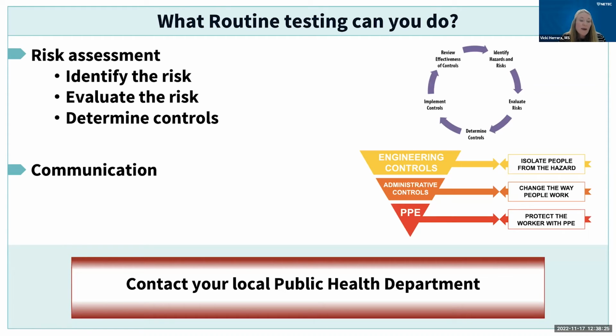All right, so after you've done your risk assessment, you went through identifying and mitigating those risks, what tests are you actually able to do safely? Each facility may have a different answer on this based on their size, the resourcing, staffing, etc. You've done your risk assessment and you're still finding that some of your processes are still in the high risk or extreme category. Then maybe your answer is that you can't do this test. Remember, we want to make sure that your patient gets the best care possible, but your safety is just as important as the patient's.